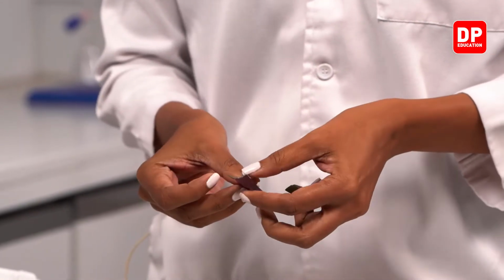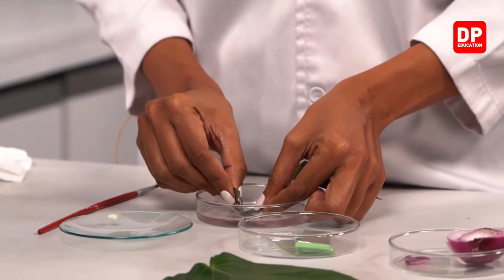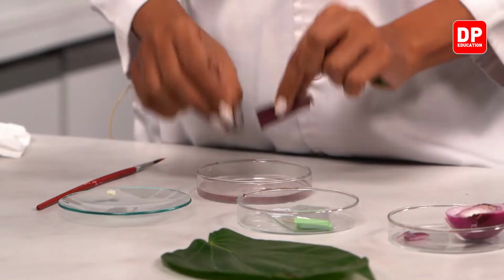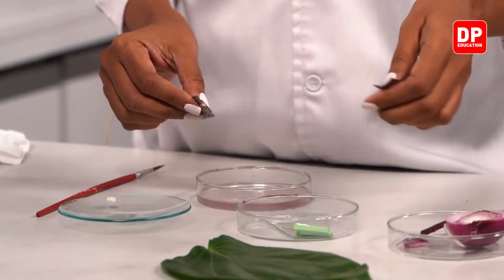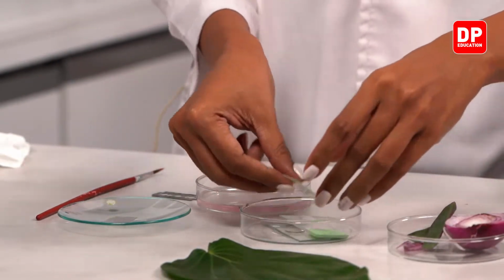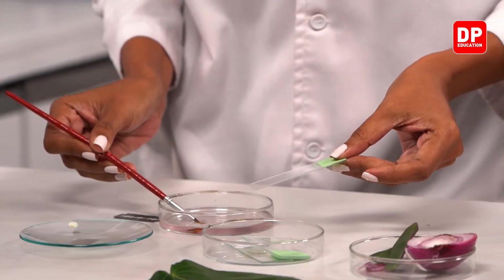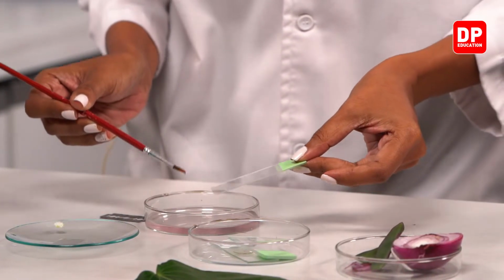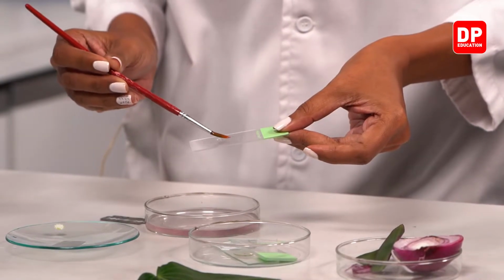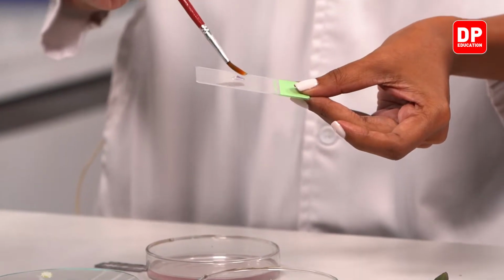So I obtain a very small, very thin piece here. Right. I'm going to use another clean slide to mount this one. Right. And I'm going to put a drop of water.